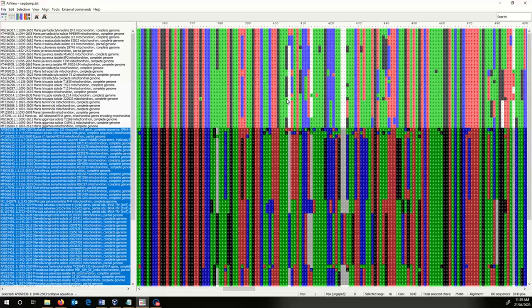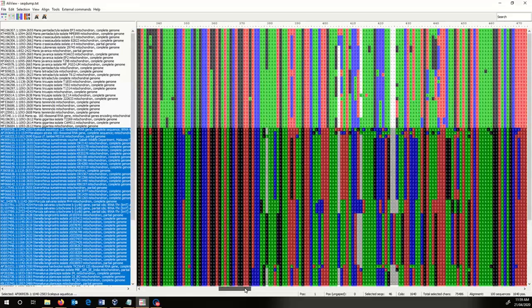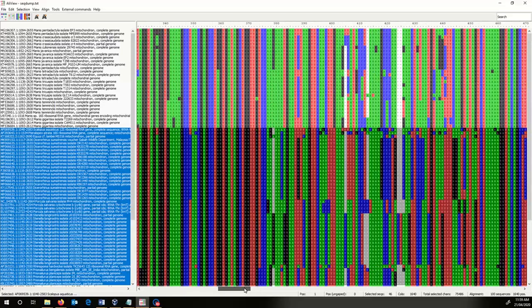What we need to do now is find a consistent difference between these pangolin regions and all of the other things in here so that they don't get amplified. Another complicating factor is that we also need to consider PCR primer efficiency.